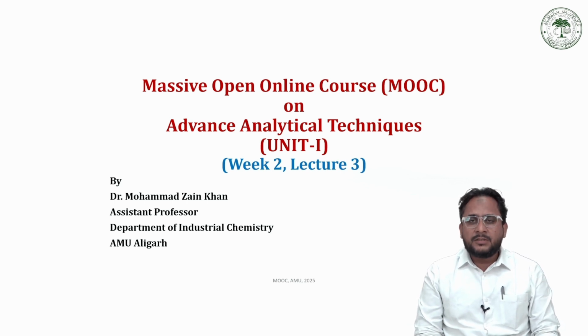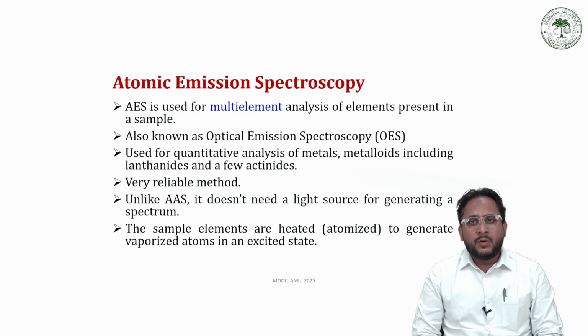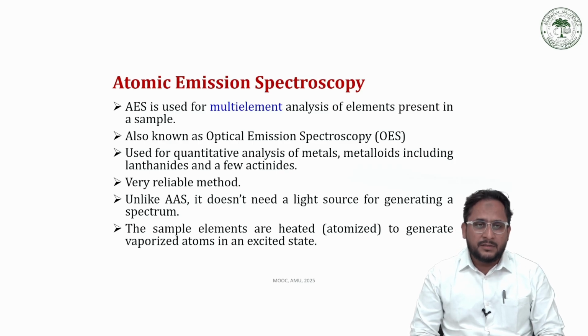In the previous few lectures, we have discussed atomic absorption spectroscopy, its principle and working instrumentation, as well as the possibility of interferences and how to avoid those interferences. Today we'll start with another technique which is very versatile and widely used in industries as well as research centers. This is called atomic emission spectroscopy. In contrast to atomic absorption spectroscopy, this technique is based on the emission spectrum.